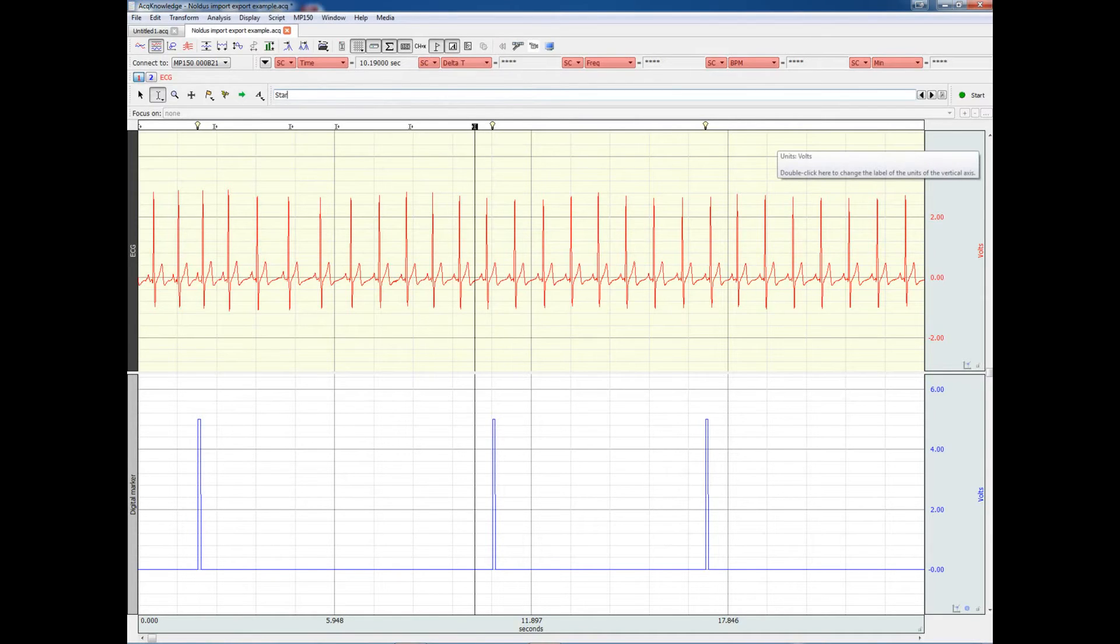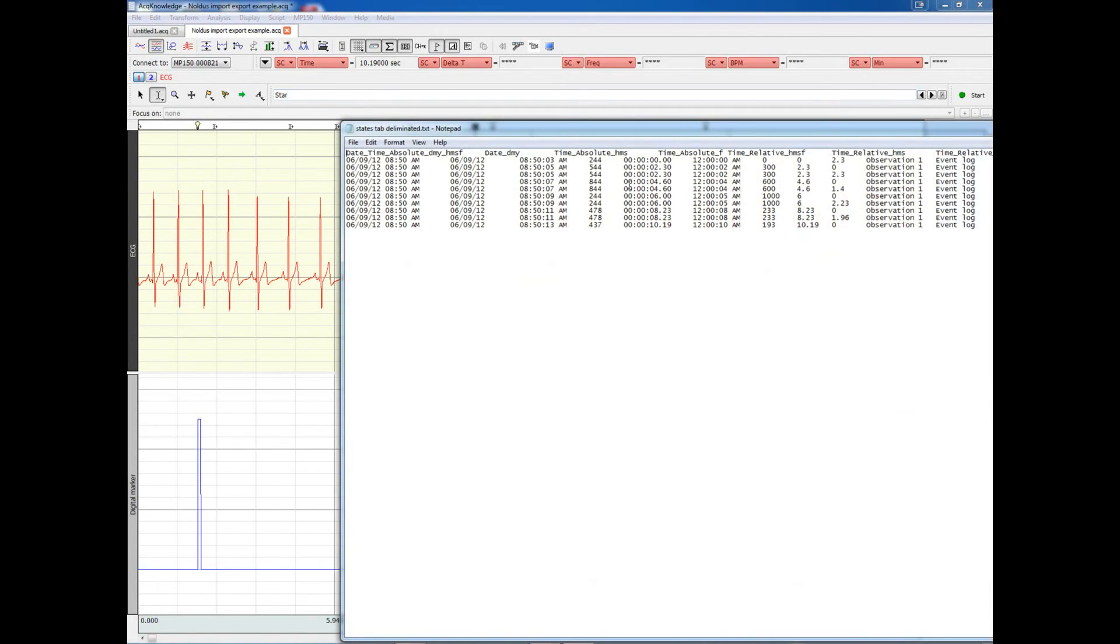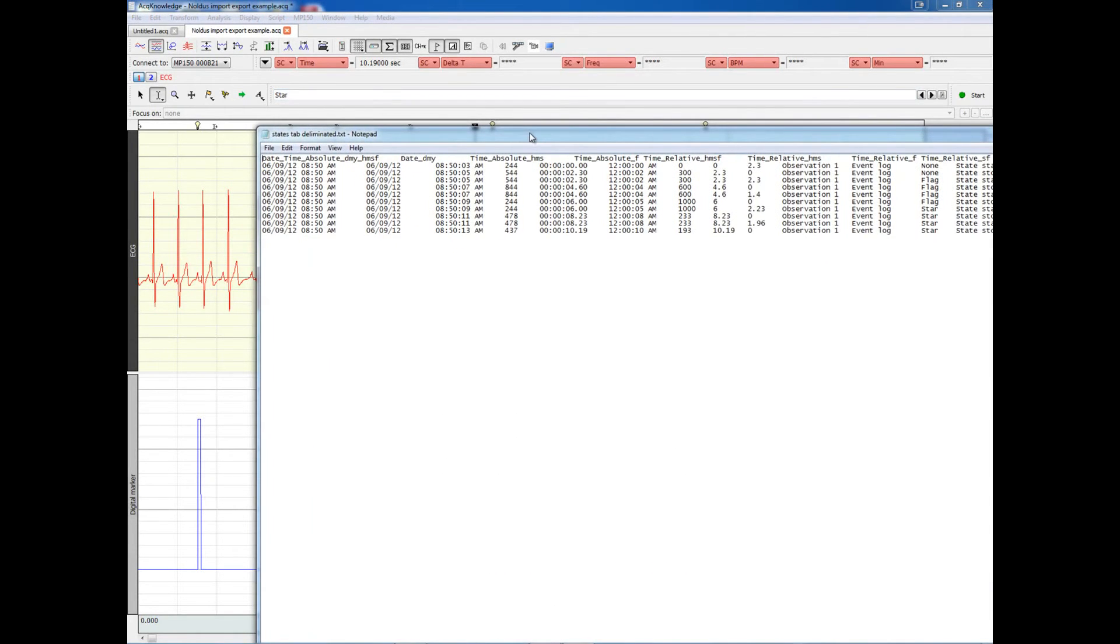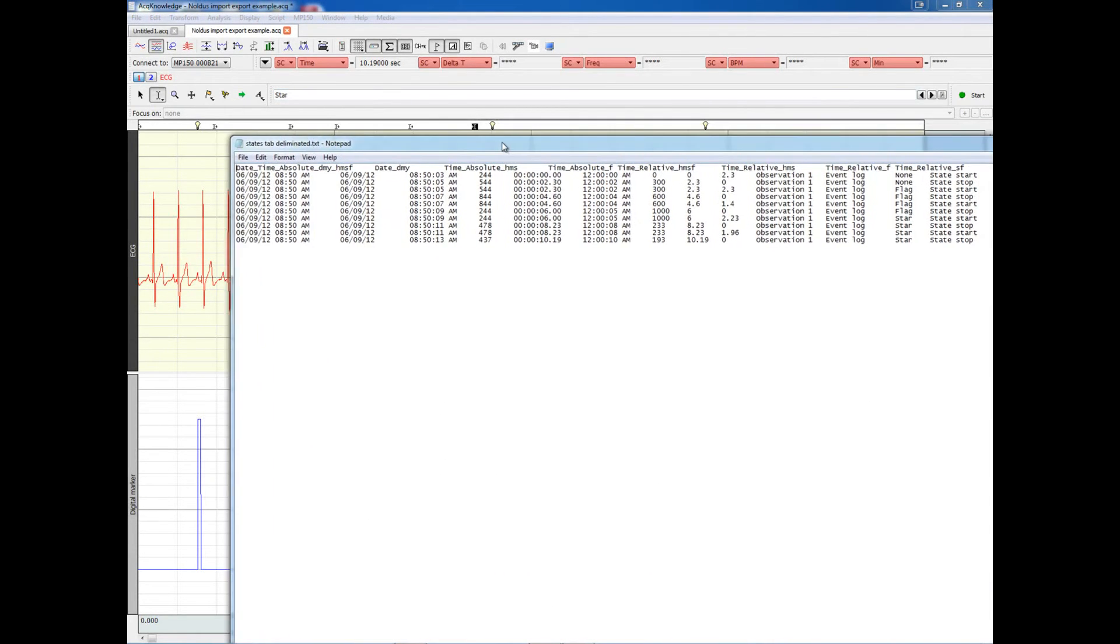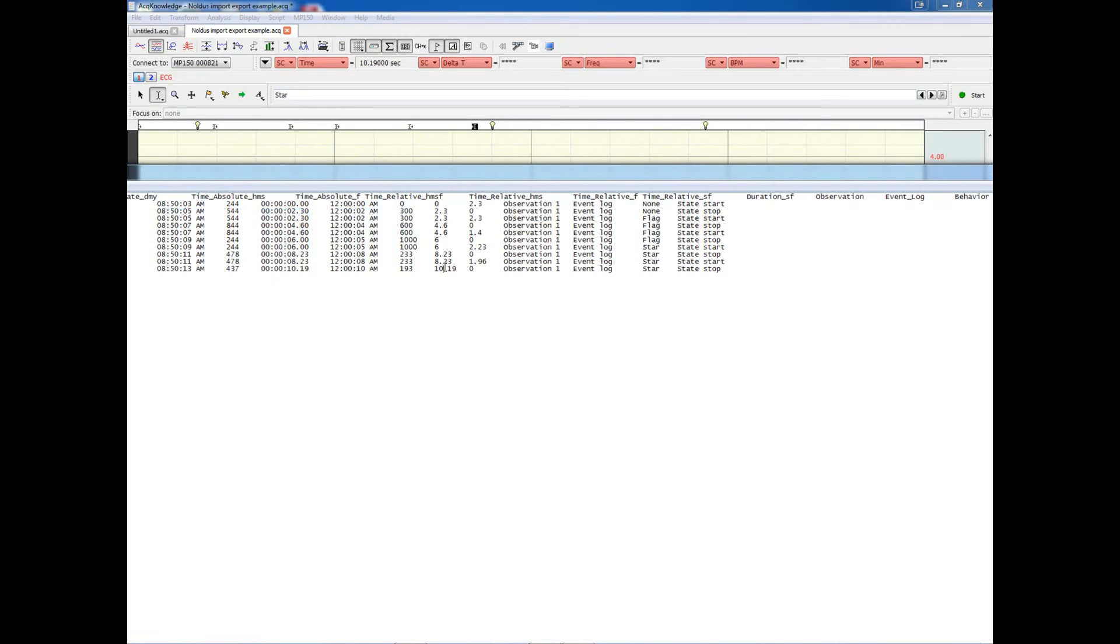If we have a look at the actual file that was exported from the Observer XT, it's a tab-delimited text file. Most importantly, we have an indication whether we have a start or a stop of an event. We have a label of the event, and we also have the time, the relative time in the recording.